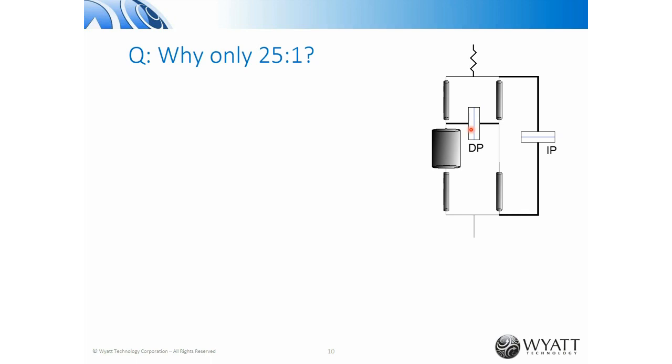And why? We did a little bit of research and discovered that, although you think of solvents as being incompressible, the delay volume is much larger than anything else in the system. So a very tiny compressibility times a large volume means that there's a net compressibility that's not balanced by something on the other side. So the pump pulses as seen by the left arm are a little bit out of sync with the pump pulses as seen by the right arm, and you don't get perfect cancellation.